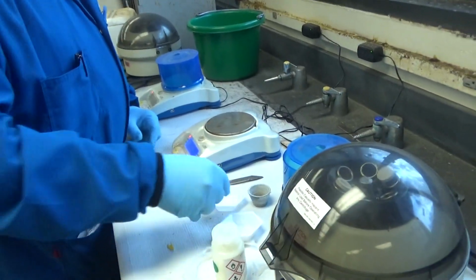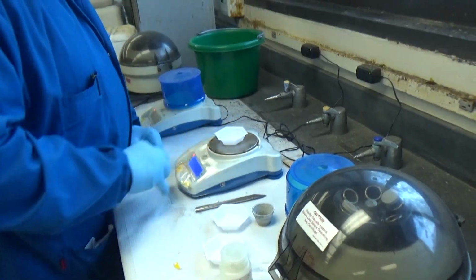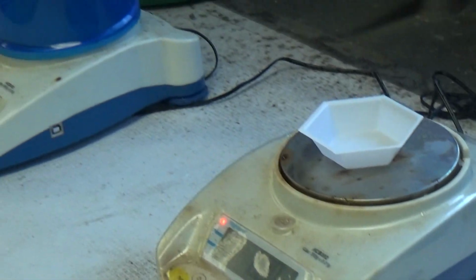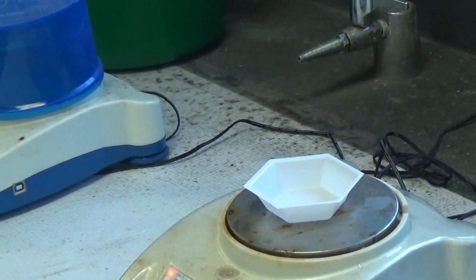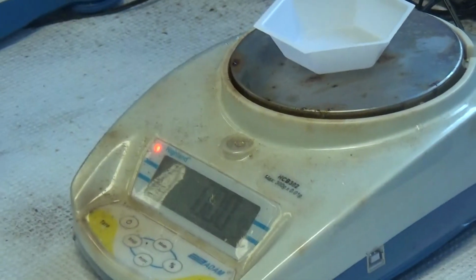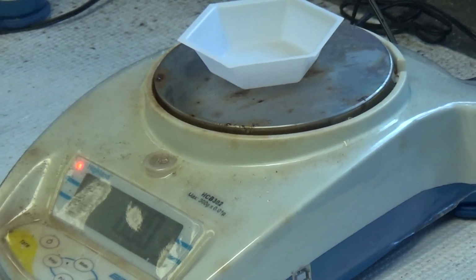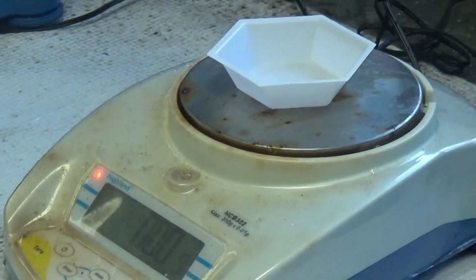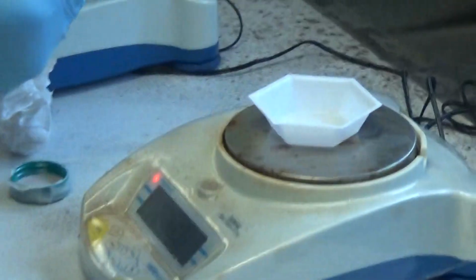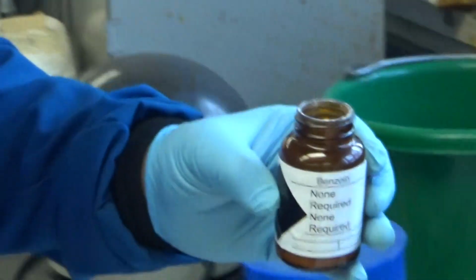Let's put that here. Then we will need 1.06 grams of benzoin, the gram plus about 60 milligrams on top. That's benzoin.